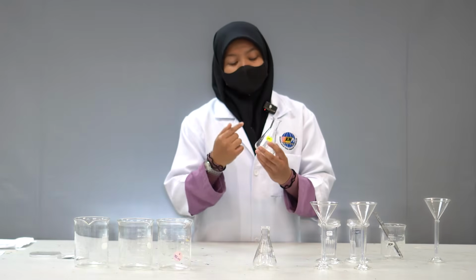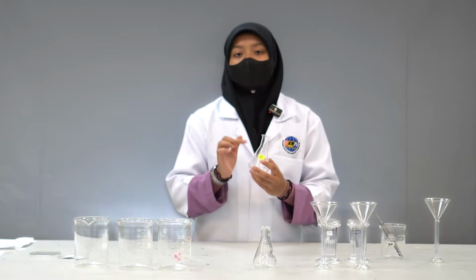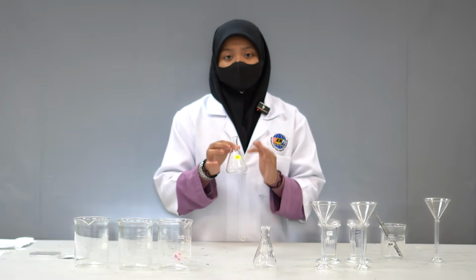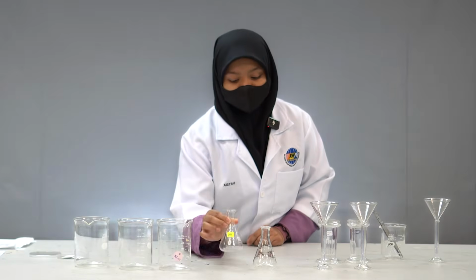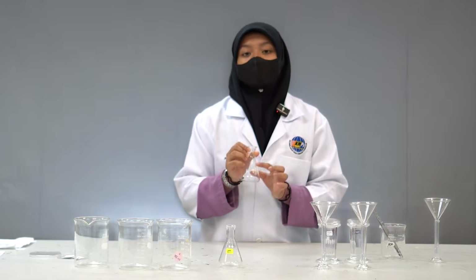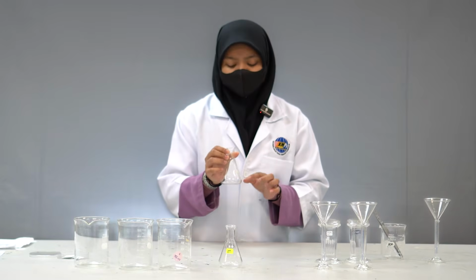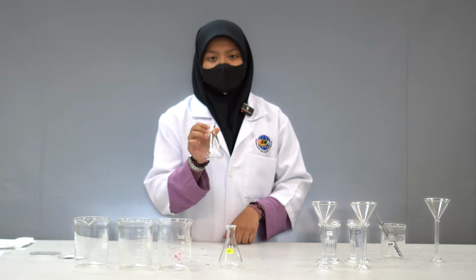So I label it HE, or hexane and ethanol, with the ratio of 9:1, which is 9 ml of hexane and 1 ml of ethanol. We take these 2 solutions in the fume cupboard, and then we pour into the flask. For the second flask, we label it DH, which is DCM and hexane, with the same ratio of 9:1, 9 ml of DCM and 1 ml of hexane.